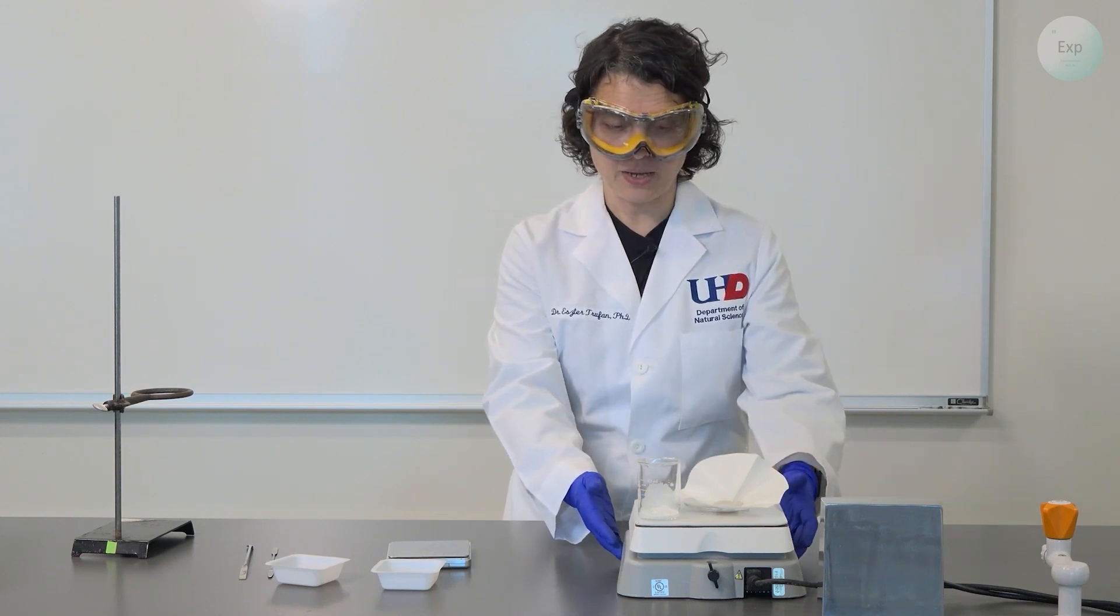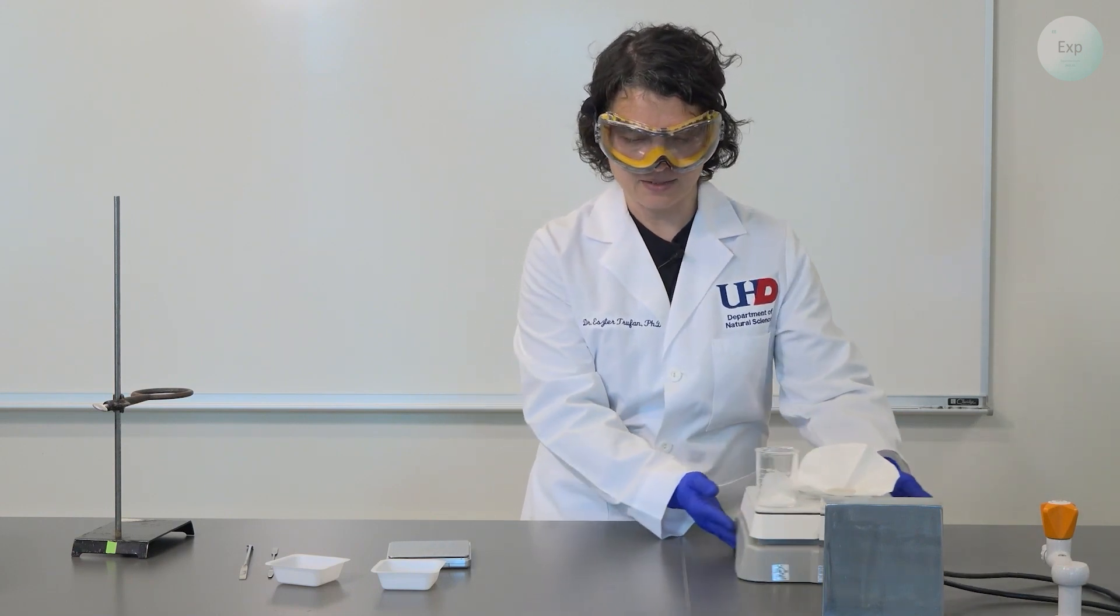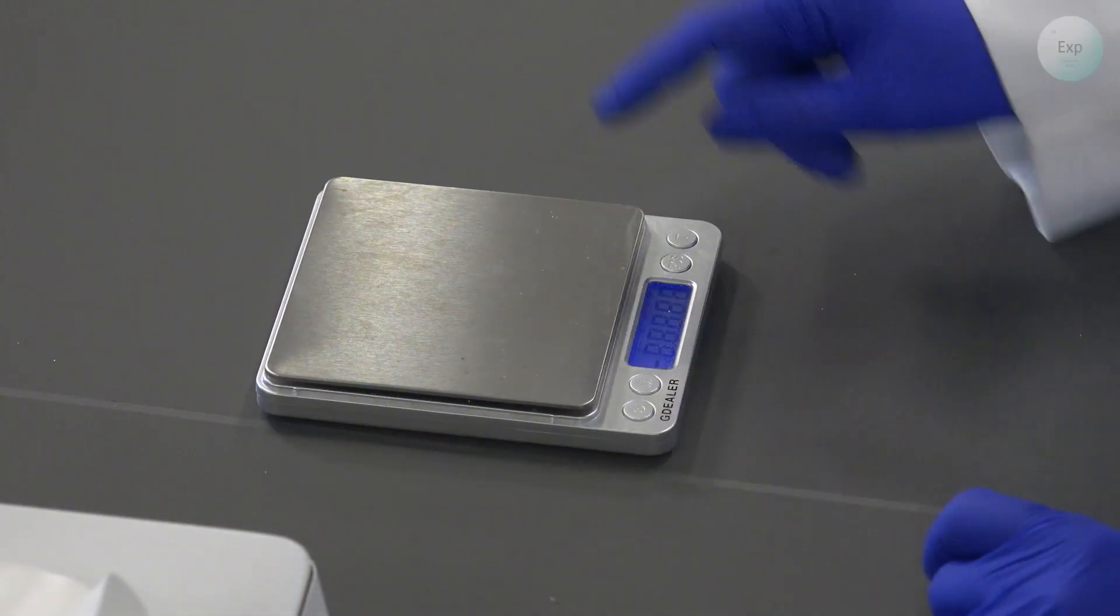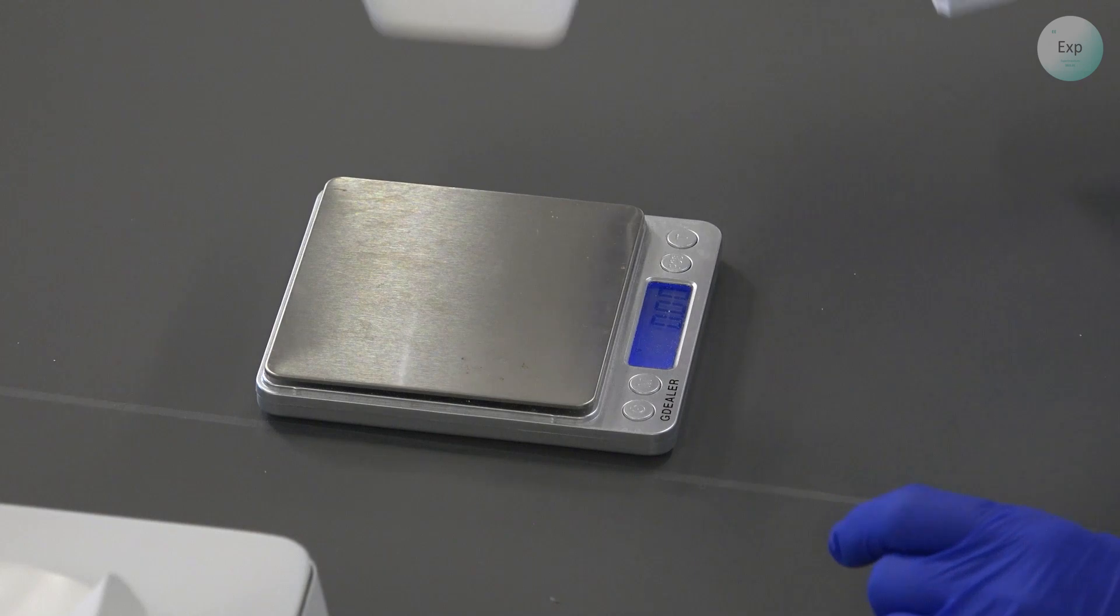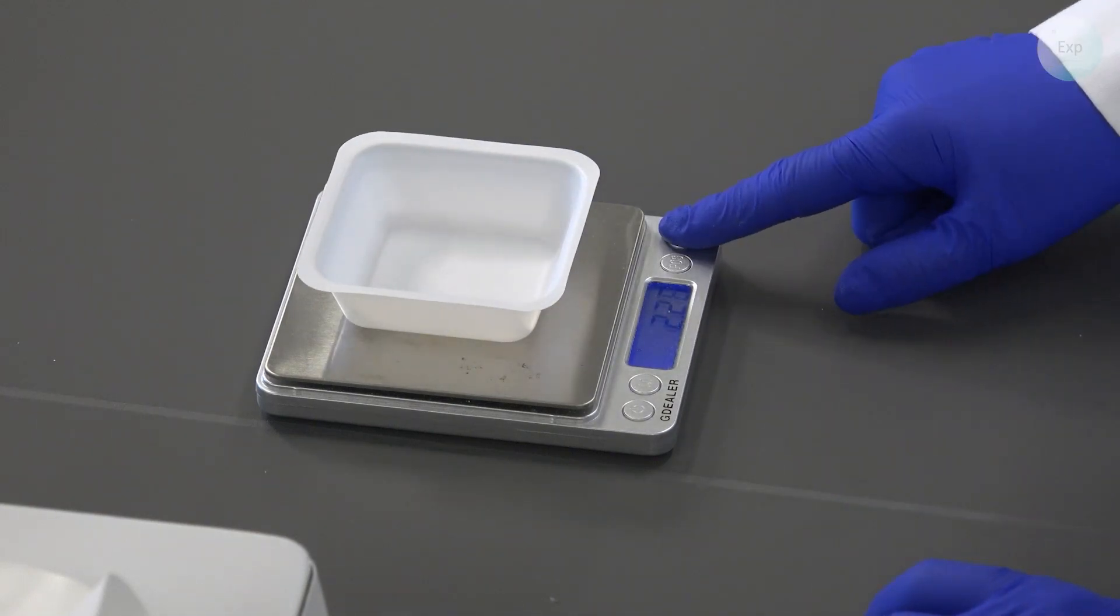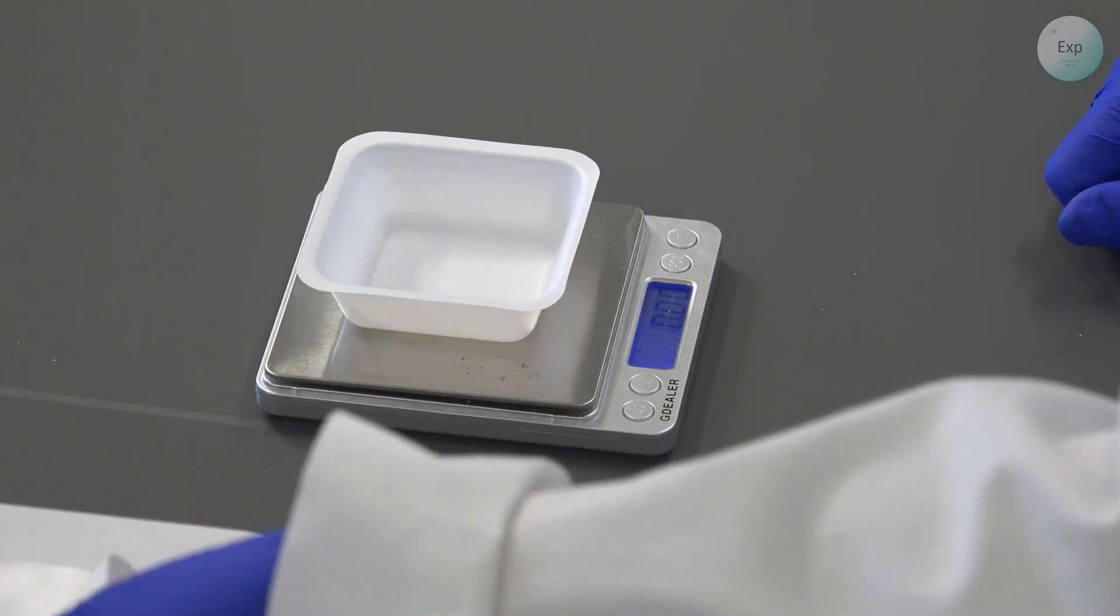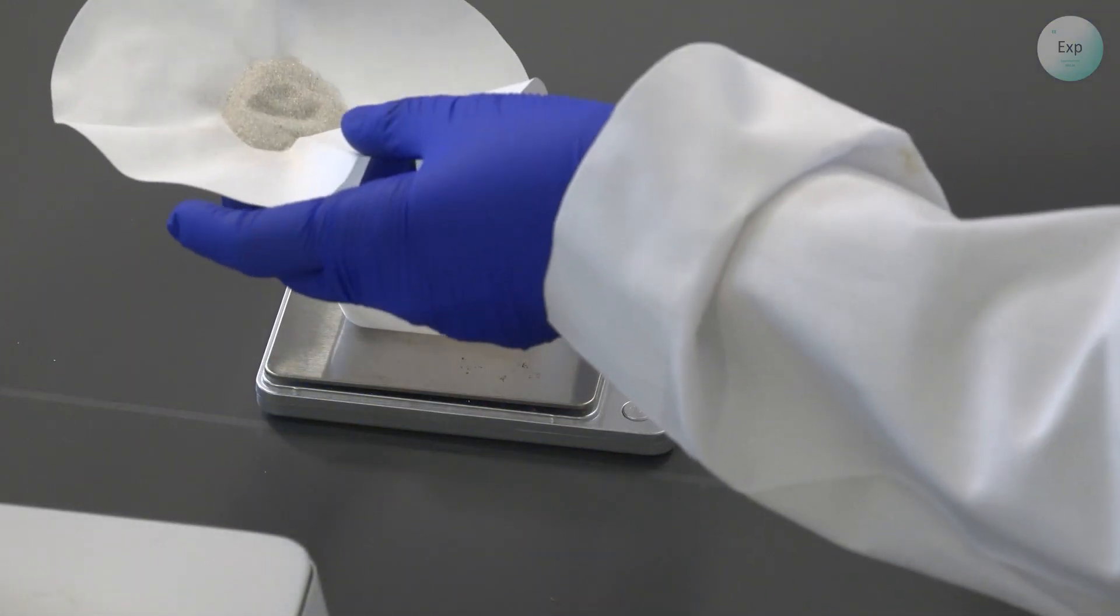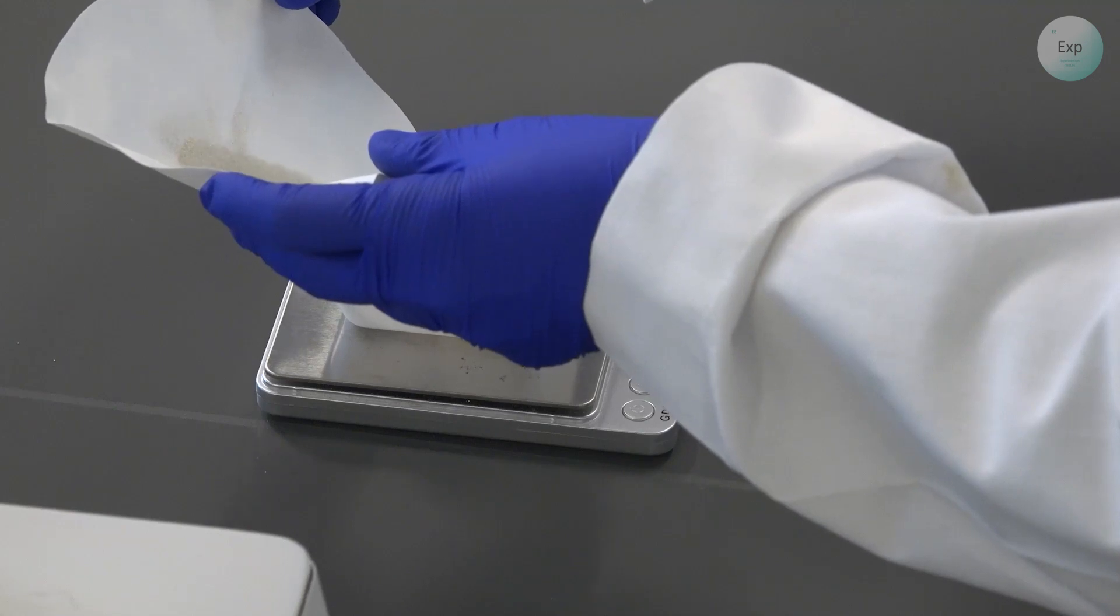I will turn off my hot plate and set it aside, bring in my scale, turn it on, bring in a clean weighing boat, tare it, and then because paper doesn't get very hot, I can pick it up from here and transfer it onto the weighing boat.